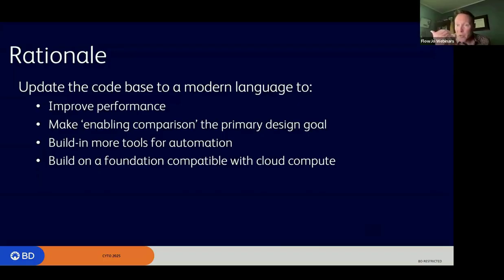I want to point out that if you've got a portal license for FlowJo, you can use 10 and 11 simultaneously as part of the same license. We're now a subscription software, so it doesn't matter which version you want to use, either one, 10 or 11, is going to be fine with your FlowJo portal license.